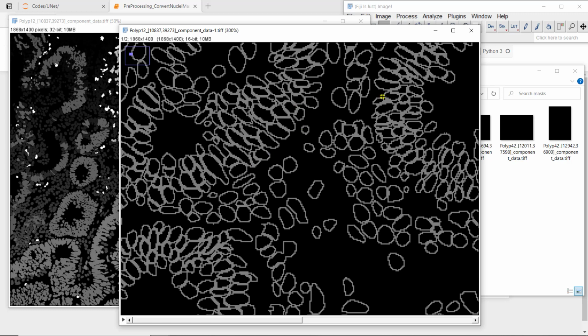And you see here, the contours are thicker in this area than when we have isolated nuclei. This is done on purpose because we know that probably the most difficult part is to separate nuclei. And just to give more chances to the algorithm, we have contours that are thicker when nuclei are touching, in order to have a UNet classifier that's going to be more trained to separate, to identify the contours.